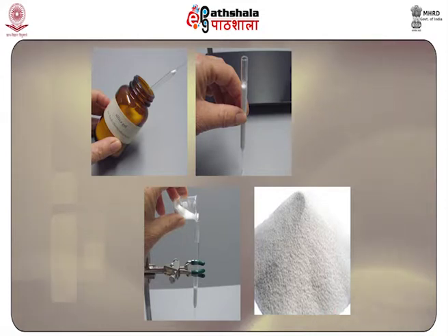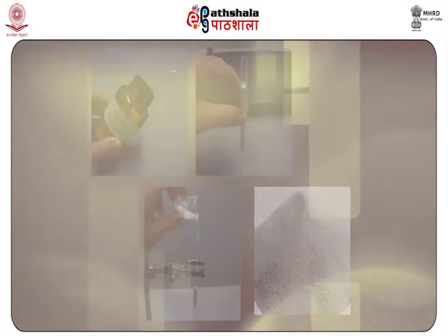This increases their surface area. The ratio between the weight of analyte and stationary phase that can be applied onto the column is also very important. This ratio ranges from 1:20 to 1:100 for silica column.